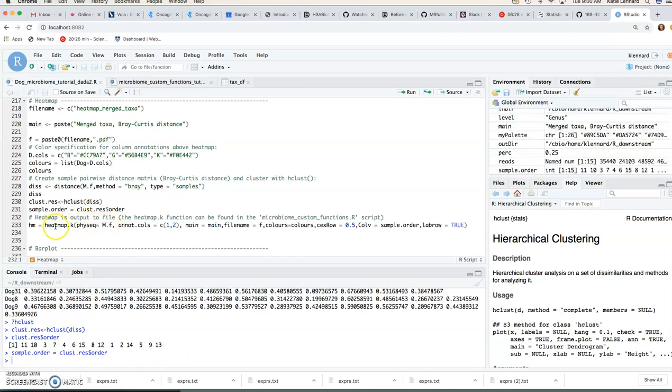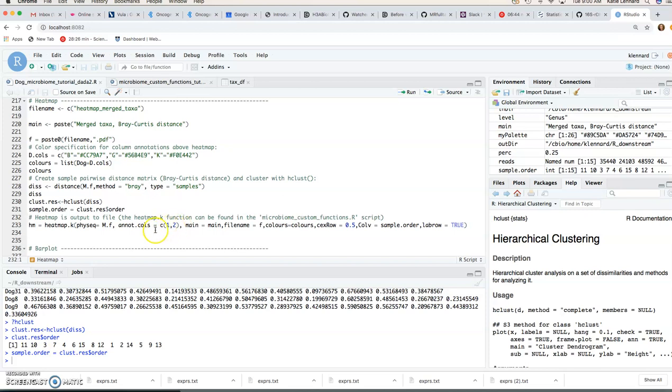Okay so our heatmap we can start building now. We specify our phyloseq object. This is the annotation columns. So in our case we only have two so we're going to specify columns one and two, the dog and the treatment. And then main, that's our title, our file name, our colors for our annotation track that we defined up here.